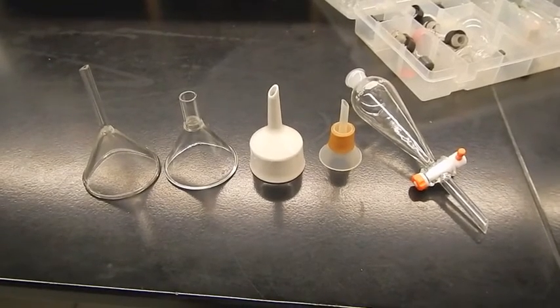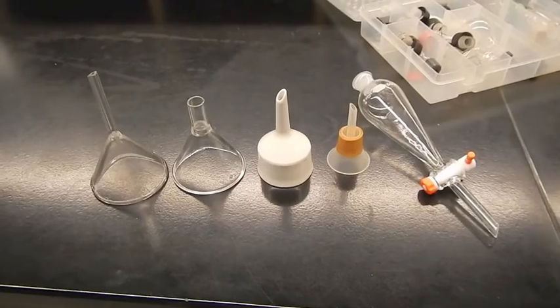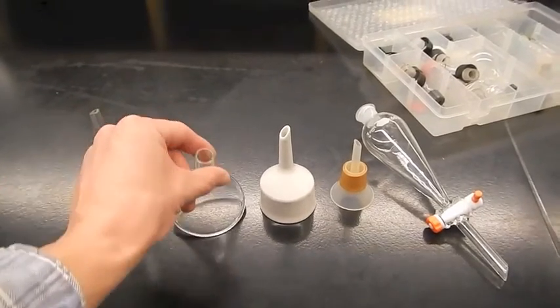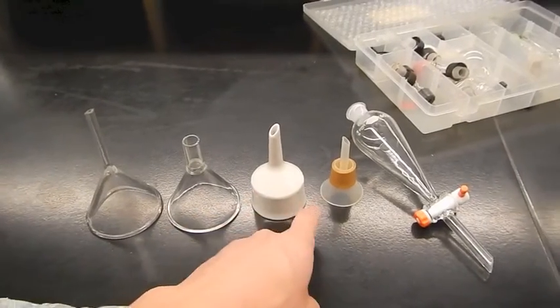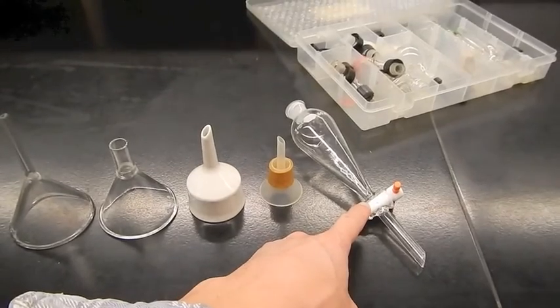During check-in, the most common question I get is, what are all these different types of funnels? So this is a standard funnel. This is a powder funnel. It's a powder funnel because it's got a big opening, so powder can actually go through pretty easily. This is a Buchner funnel. This is a Hirsch funnel. And this is the separation funnel, or SEP funnel.